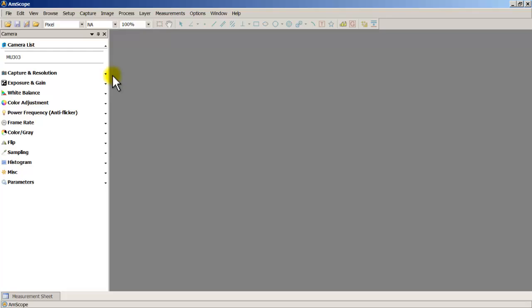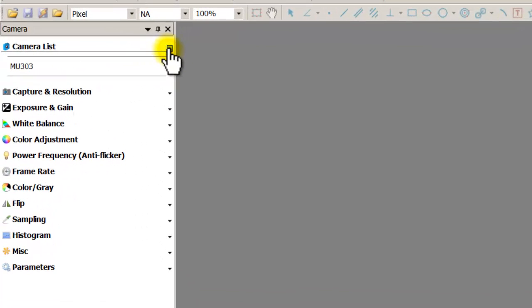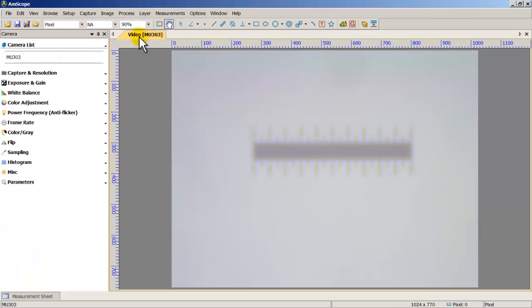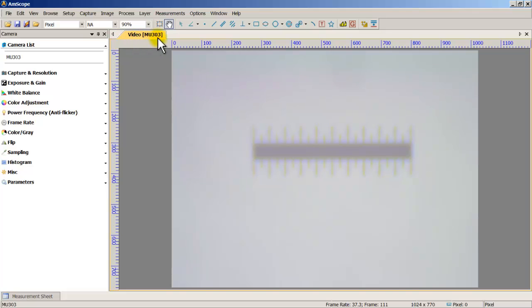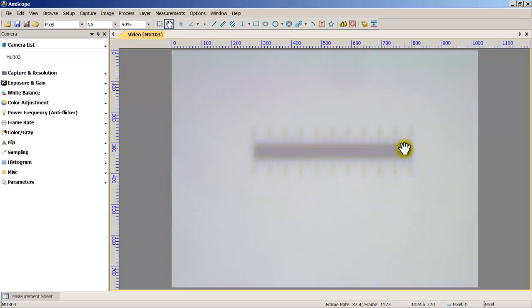To activate the camera after you plug it in, open the software and your camera should show up in the camera list. Right now I have an MU303 connected, so I'll select that. It brings up a new tab showing the live video screen from my microscope. On screen right now I have a micrometer stage slide — this stage is graduated in 0.01 millimeters, so the entire length from left to right is one millimeter. Let me refocus using the fine adjustment tool.